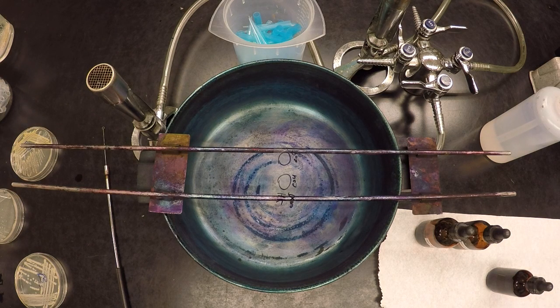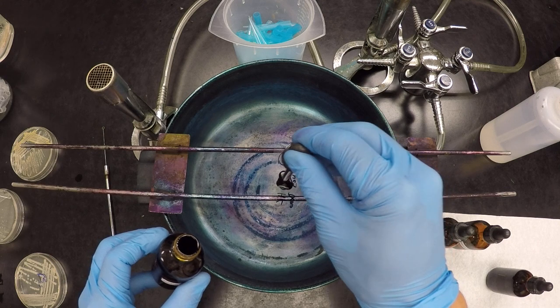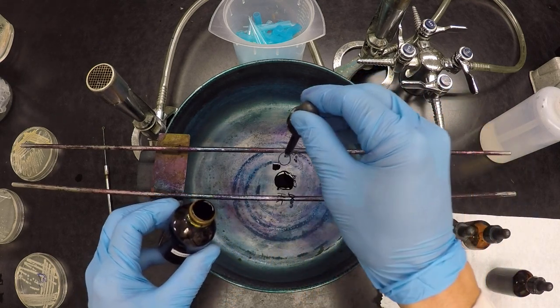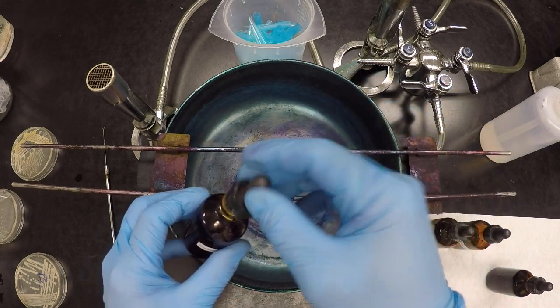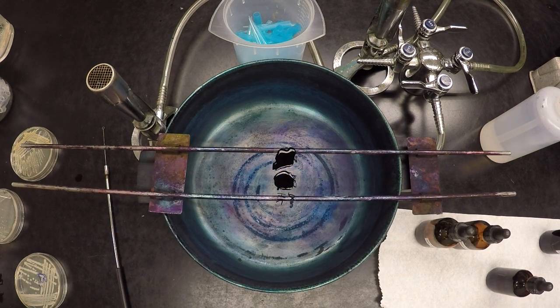And at least at the beginning, the procedure is the same, right? I'm going to take my crystal violet, my primary stain, that goes on first. And I'm just going to flood my two smears. And that goes on for about a minute or so. I'm just going to let it sit while I talk.